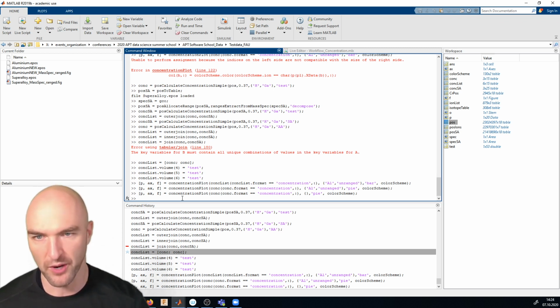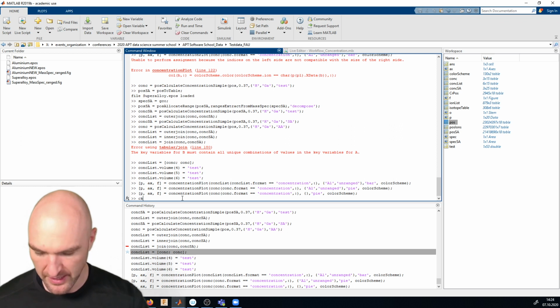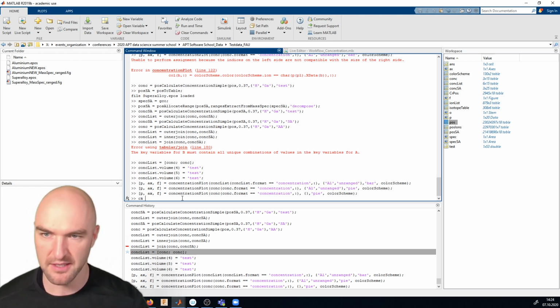So you can write your own concentration kernel, just like the one that Andy London was just talking about, and you can plug it into any of our analysis downstream. Okay, and this is something that's very, very important to us. And the way you do that is you create something that's called a function handle, and you can look up how that goes.